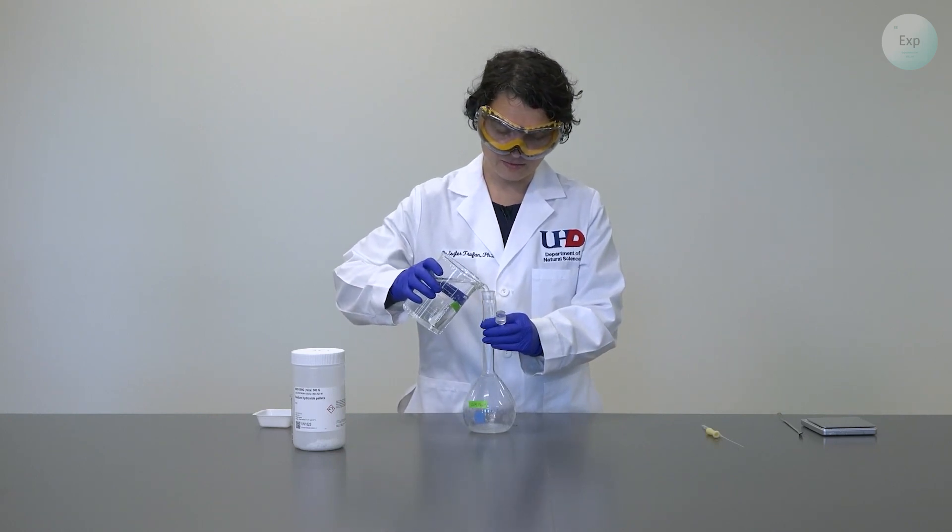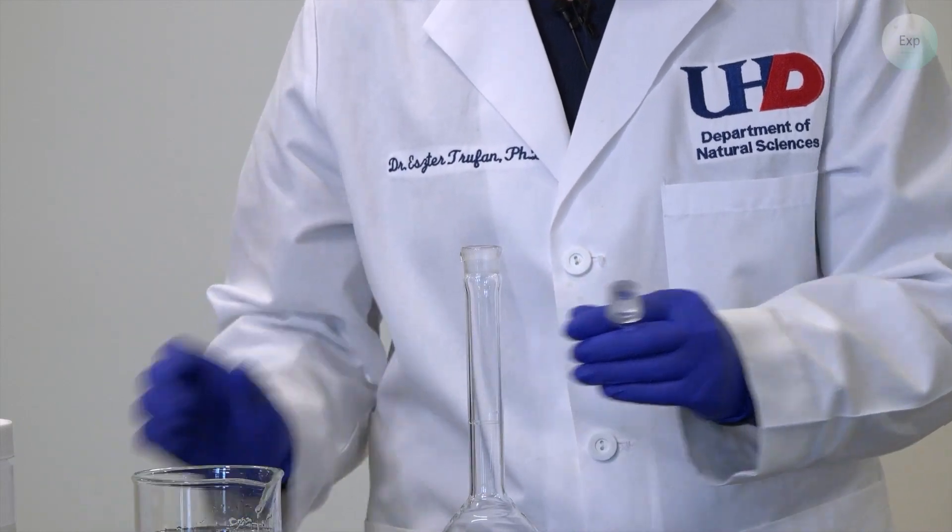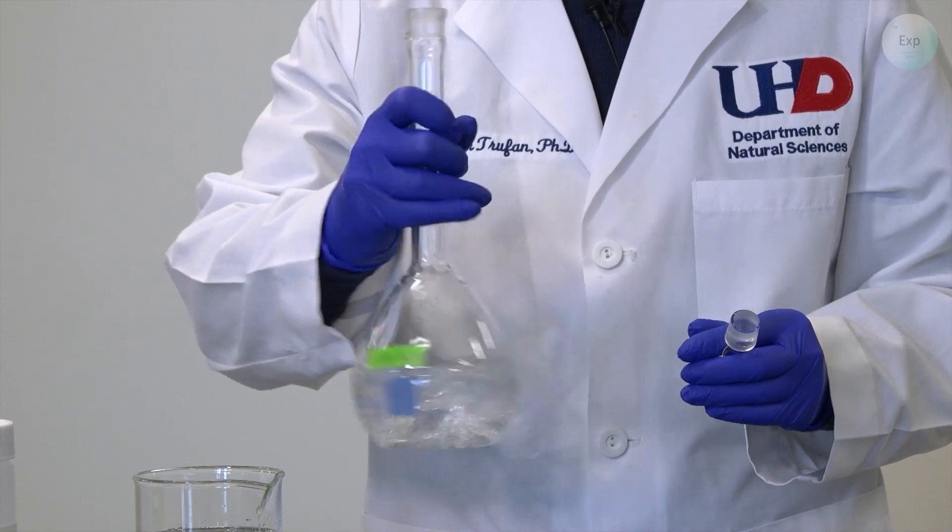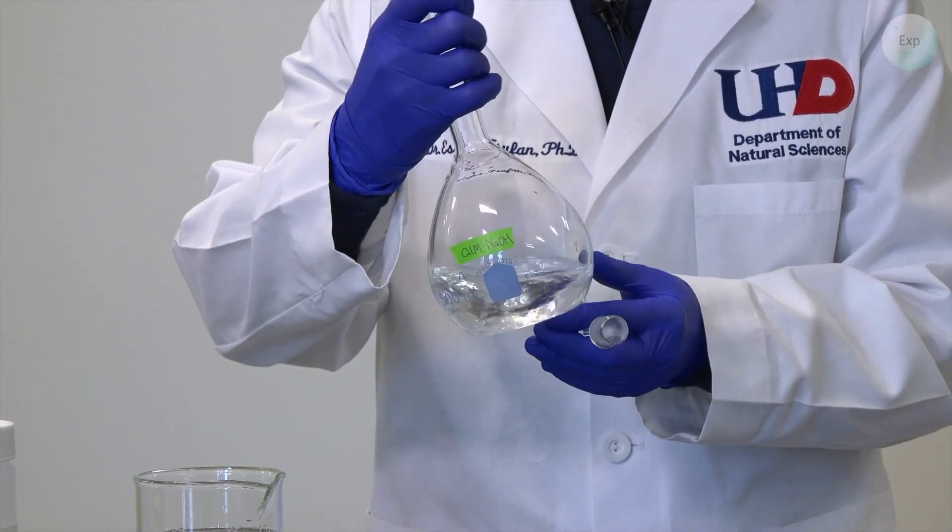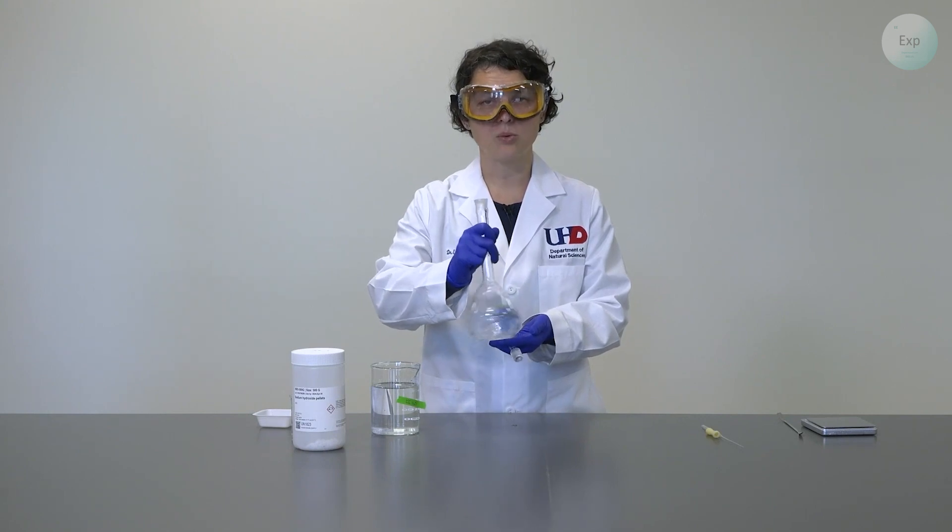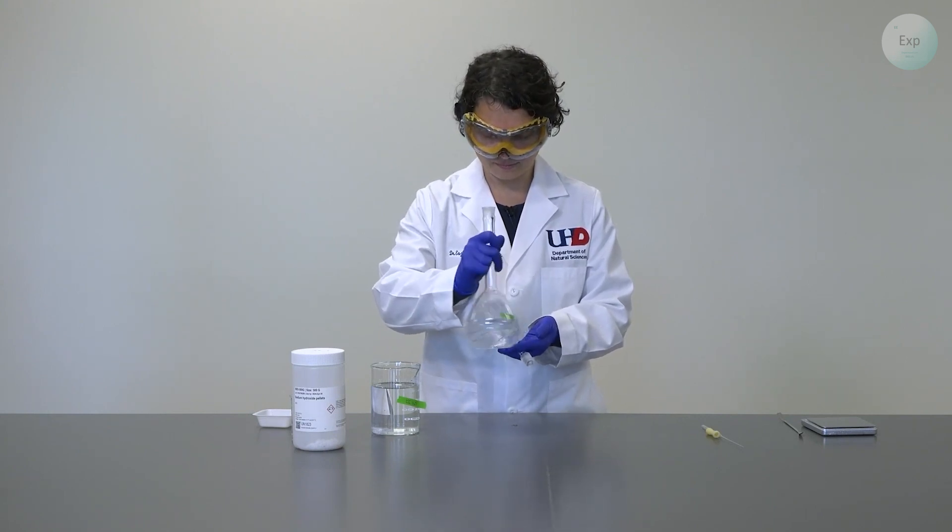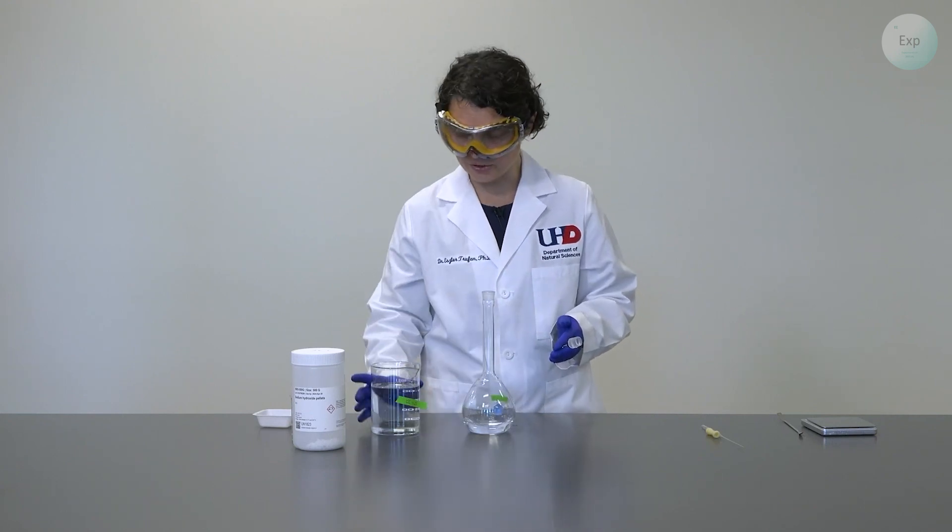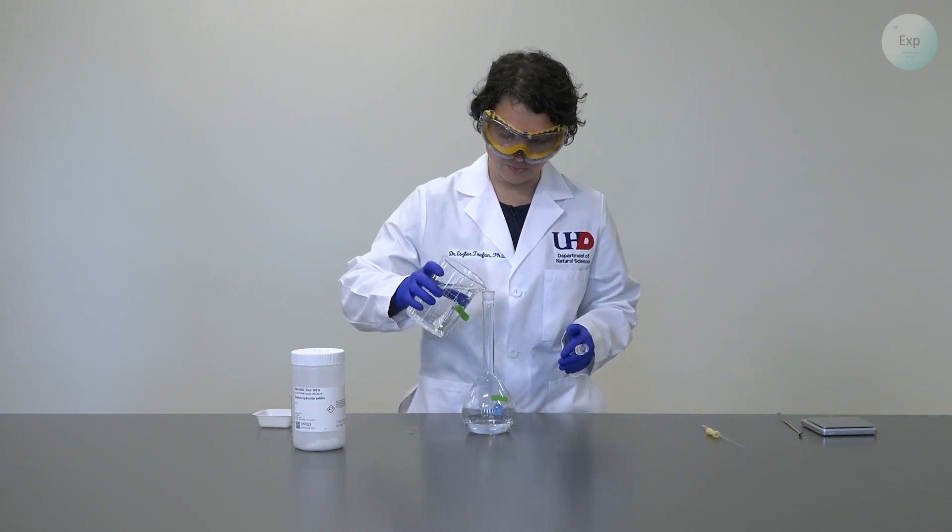So now we start adding increments of water. And with every addition, we shake our volumetric flask really well. The aim is to dissolve the sodium hydroxide in as little water as possible. If it doesn't work on the first addition, we add more deionized water.